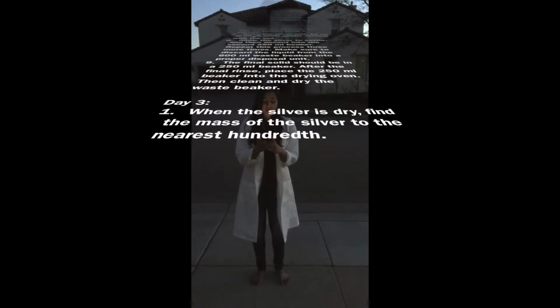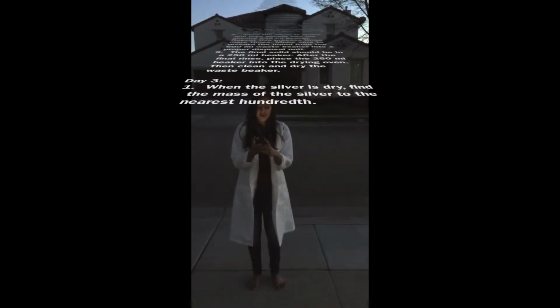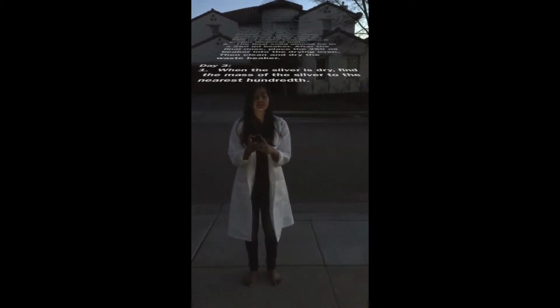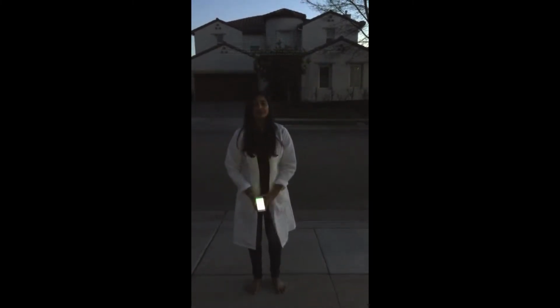Step 9. The final solid should be in a 250 milliliter beaker. After the final rinse, place the 250 milliliter beaker into the drying oven, then clean and dry the waste beaker. Day 3. Step 1. When the silver is dry, find the mass of the silver to the nearest hundredth.